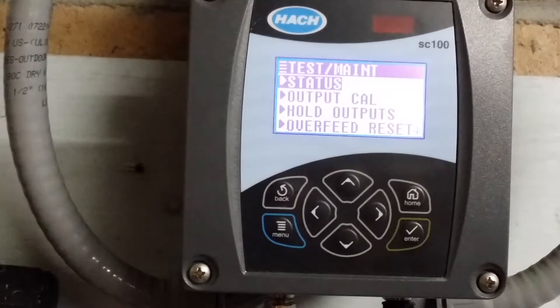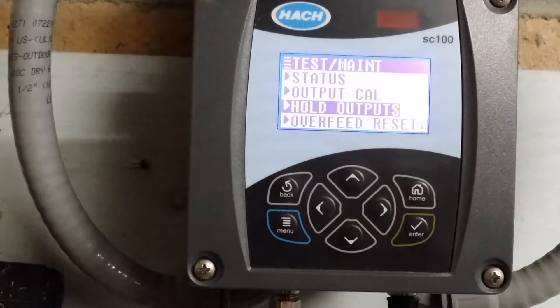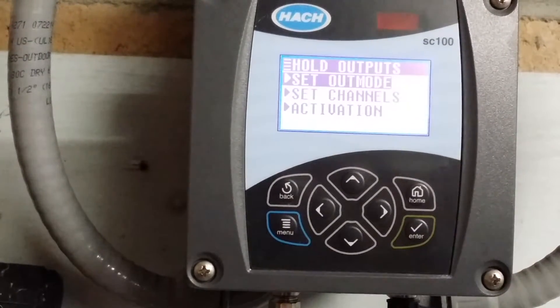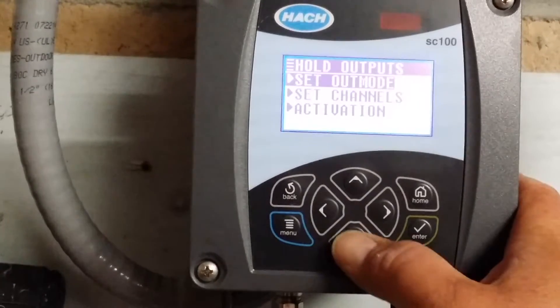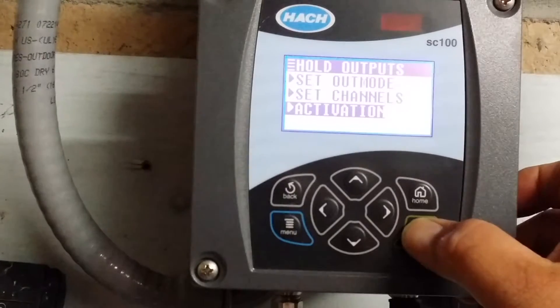Here we are in the test maintenance screen with several options. We will scroll down to the hold outputs option and hit enter. We are on the hold outputs screen which gives us three options. We will scroll down to the activation screen and hit enter.